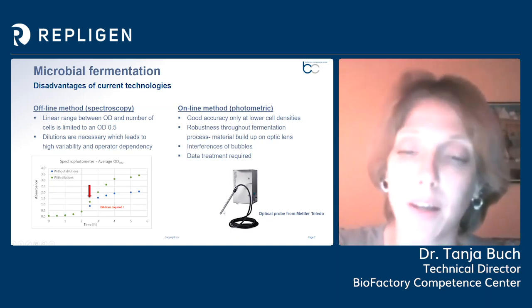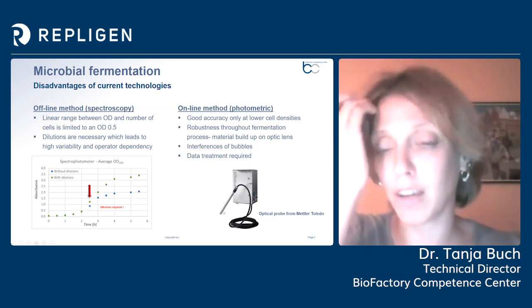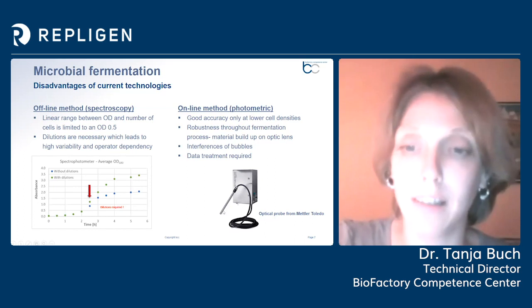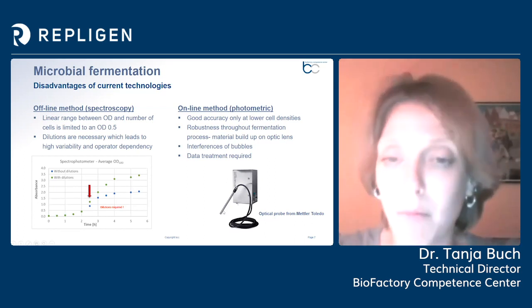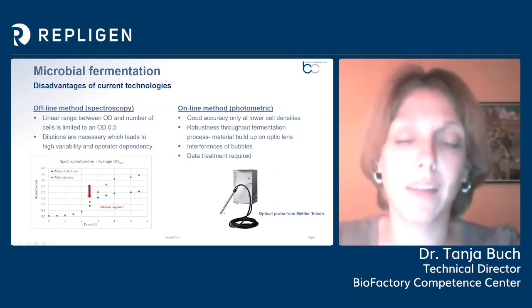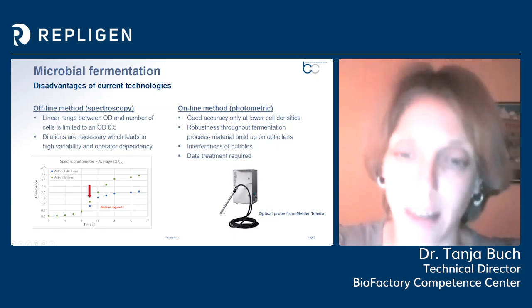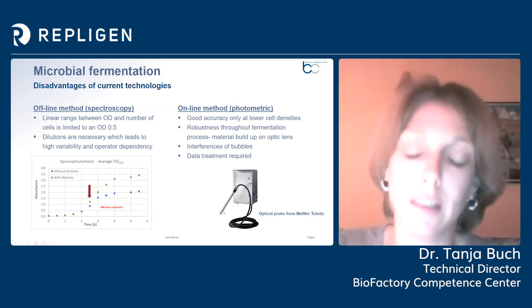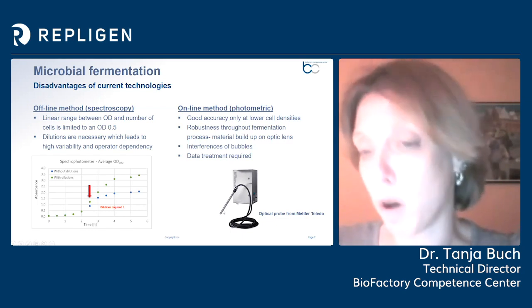one specific point, but we are always measuring a spectrum at each given time point when we have to measure our cell density. And if you measure a spectrum, you need to do chemometrics models in order to convert the spectrum into one real given data point, which can be equivalent to the optical density value. And these can be time consuming and also need a certain expertise in order to develop these models.